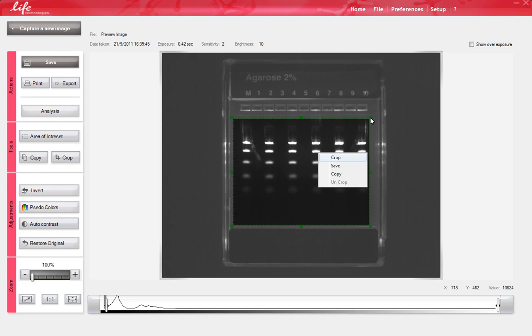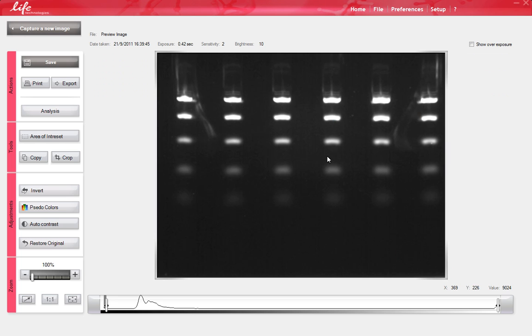You can also right-click on the image to uncrop, copy, or save an image at any time. Select Crop. To return to the original image, right-click on the cropped image.